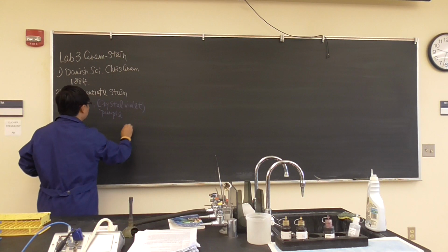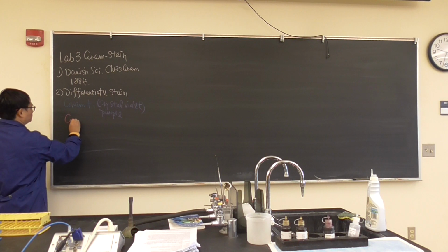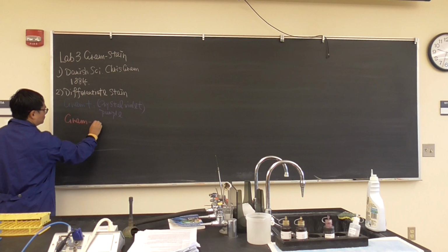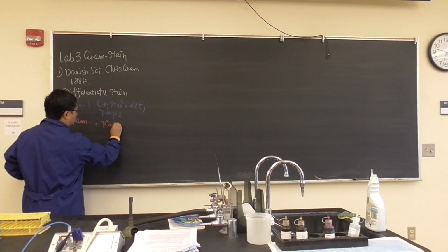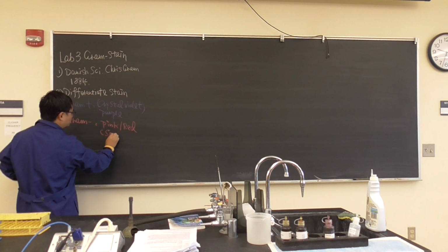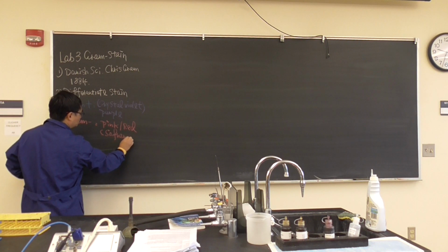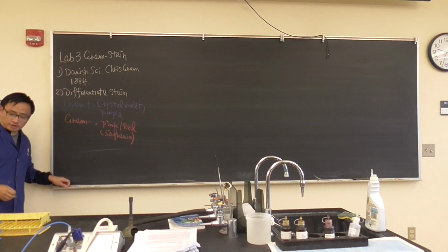I'll just put a quotation mark. And the gram negative bacteria stain pink or red. I would just say it's safranin in color. And this is for bacteria.